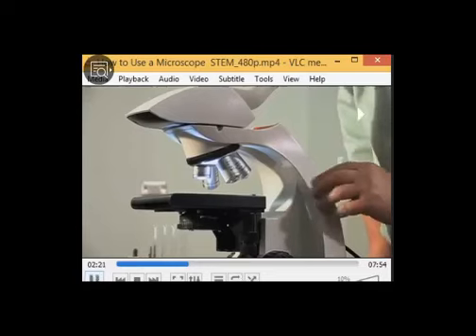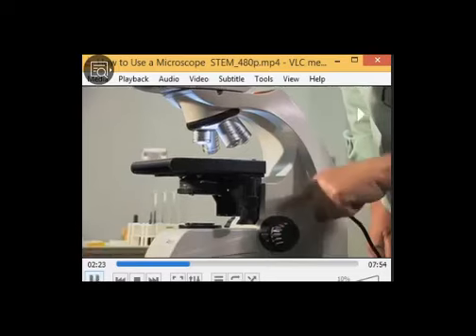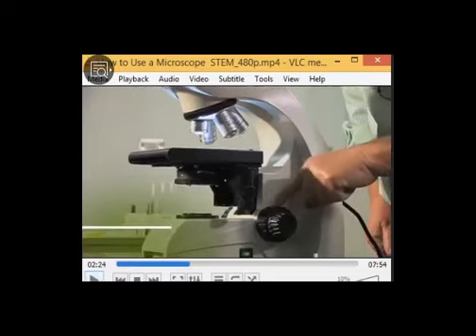Okay. Now another thing is the focusing knob. I told you about the focusing knob. These two focusing knobs are important to move the slide up and down, to focus the slide, to make the slide clear. The big button is called the coarse focusing knob.